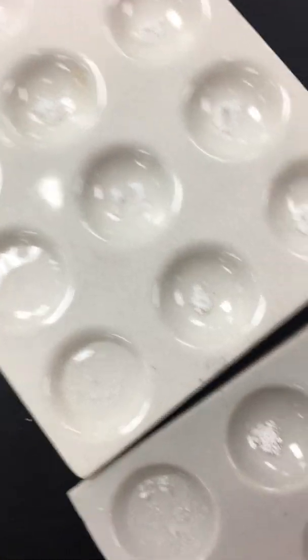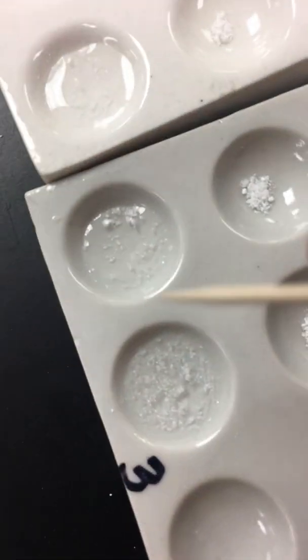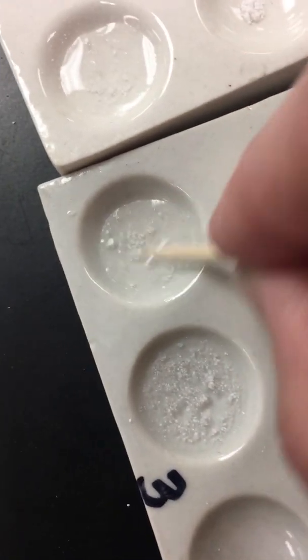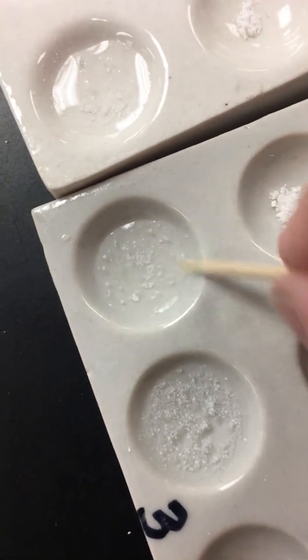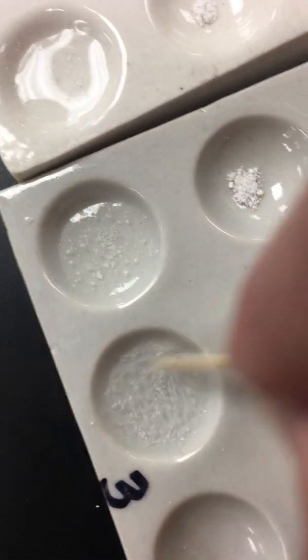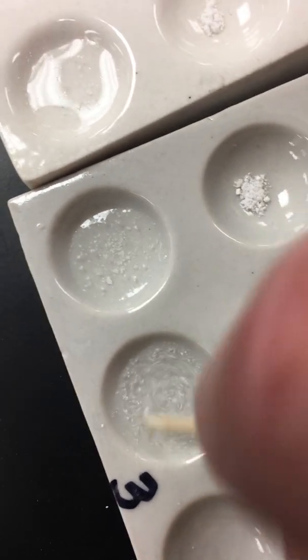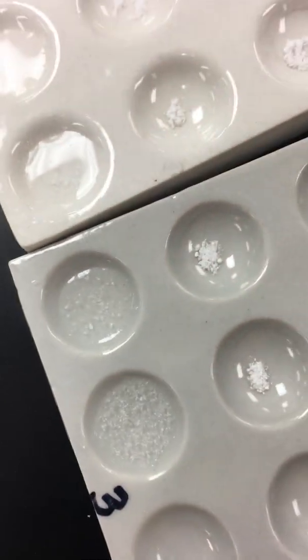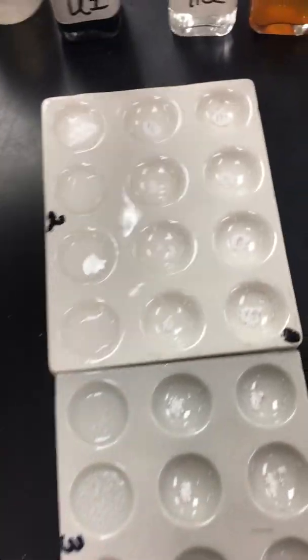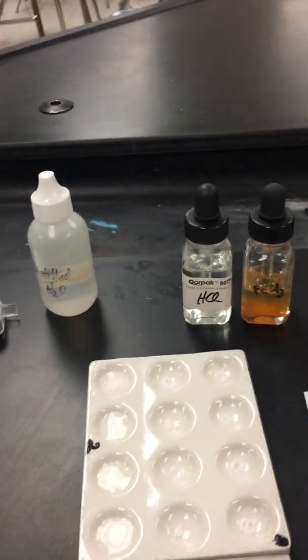All right, let's get another toothpick. And then we have Excedrin. Again, it's kind of more on the top. And then we have ibuprofen, which is, again, really sitting on top. So those are how it reacted with distilled water. So now what I'm going to do is add the universal indicator.